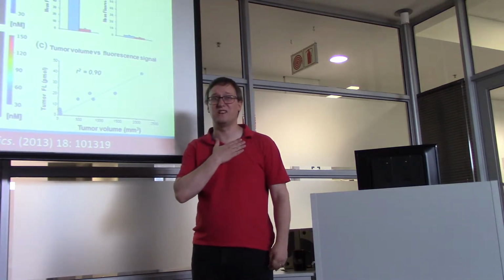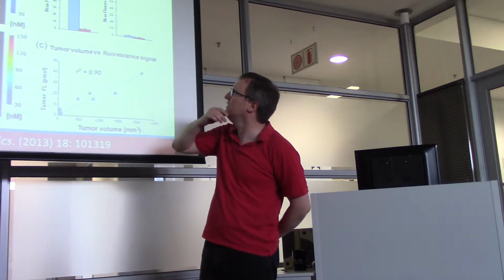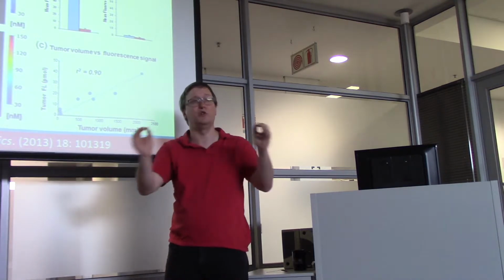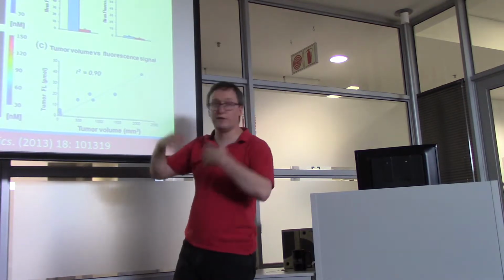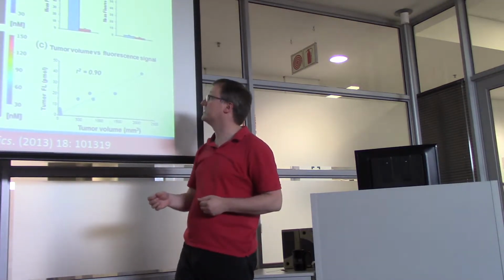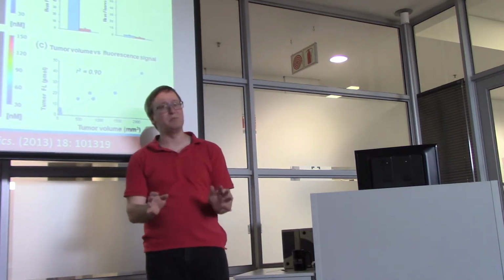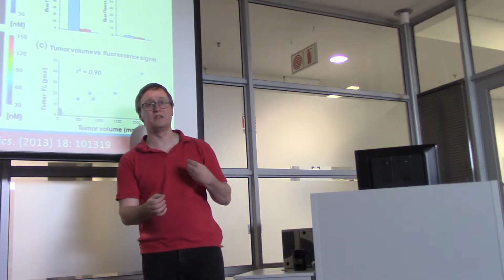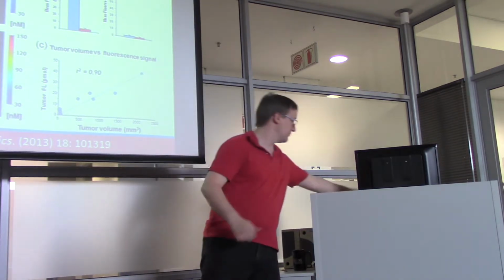Okay, and of course we love quantitation. Now I spent 10 years doing colon cancer research back at my old place. So when we do quantitation, we may be trying to ask about the spread of a cancer. What is the tumor volume as a function of time? We can do this by using our fluorescence signal and trying to quantify from it. So quantitation is a big deal. If you have a pretty picture, that's great, and it'll probably play well in a conference. But if you're trying to pull in quantitative information from it, having the ability to do this bioinformatically is going to make a big difference.